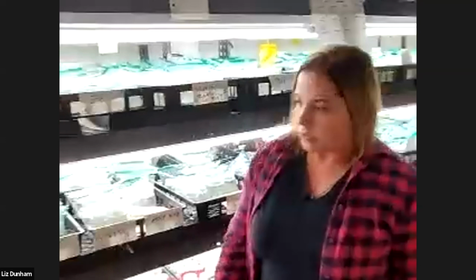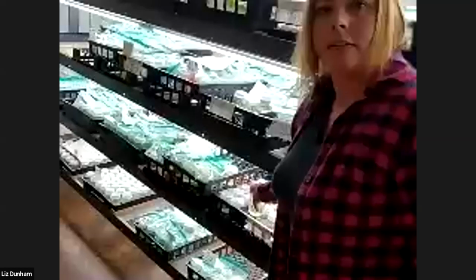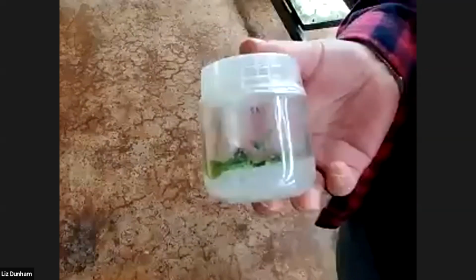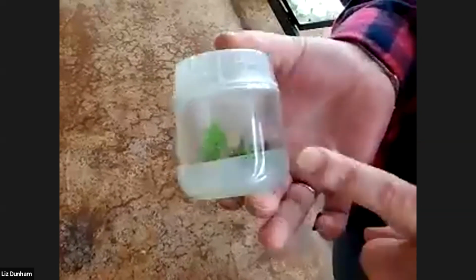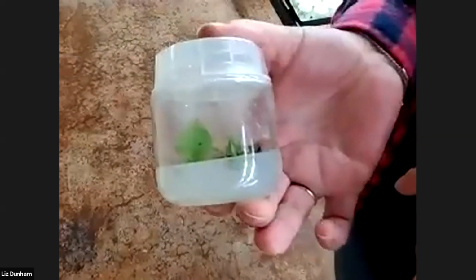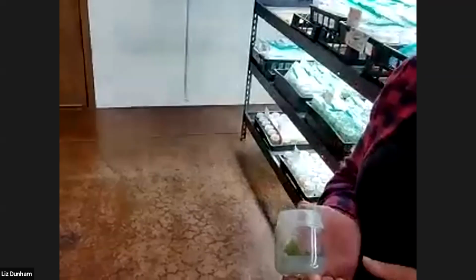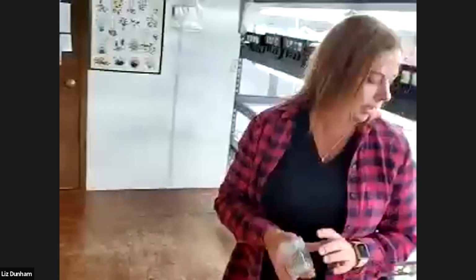Let me show you just real quick now that you've seen that. So this is what we call a new isolation. These were plants that were out in the greenhouse, let's see, 7/16 last week or so. And we washed them and we put them in culture, and it looks like they're just starting to grow. So hopefully they'll continue to do that, and in about 3 weeks, we'll be able to take more cuttings. 3 weeks is the cycle in here. 3, 4, maybe 5 weeks. We can turn over plants and get a doubling, a tripling, a quadrupling.